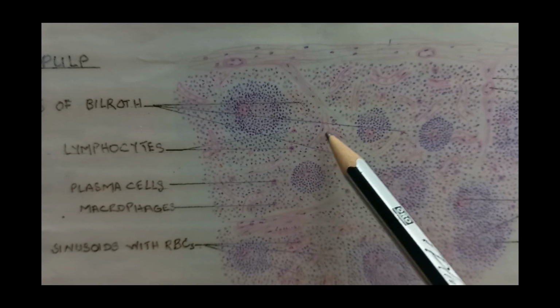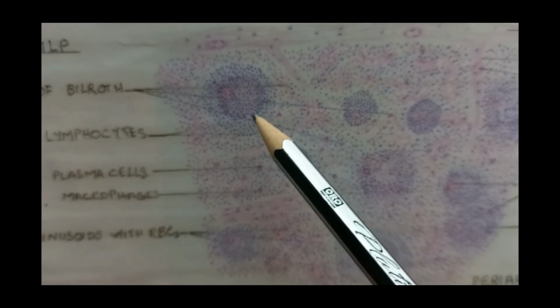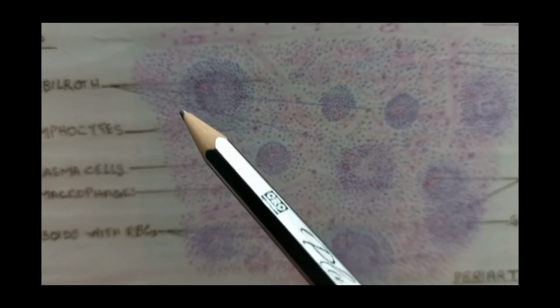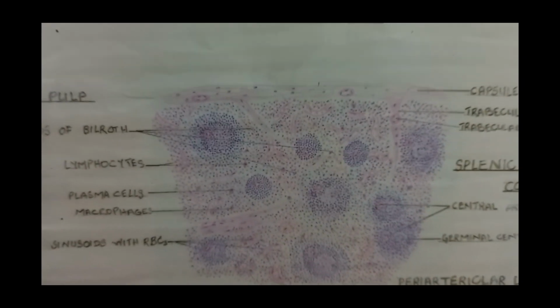These are the splenic sinuses. And in the white pulp, you will find the typical lymphoid tissue with the secondary lymphatic nodule with the germinal center, periarterial lymphatic sheath, and central artery. So this was all about the spleen. Thank you.